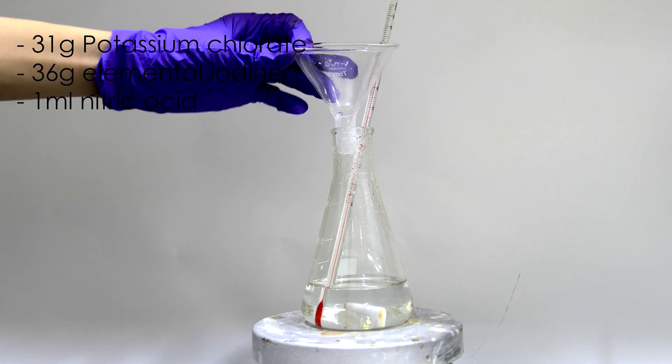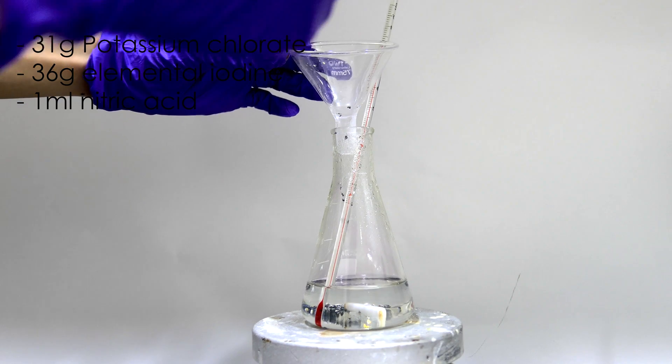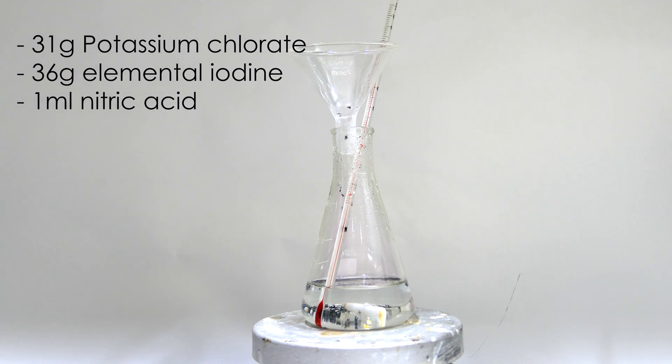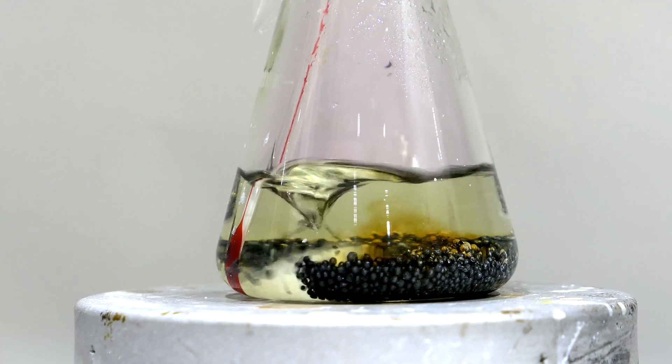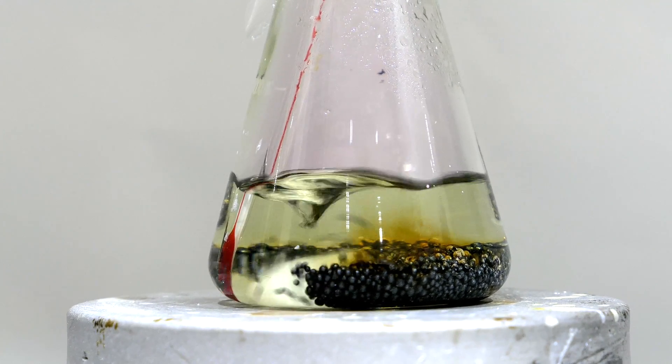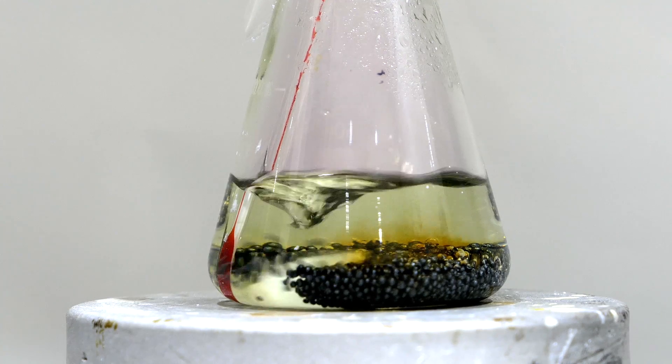First, 31 grams of potassium chlorate is dissolved in 100 mL of water. Wait for all the solid to dissolve, and 36 grams of iodine is added. Then add 1 mL of nitric acid as a catalyst.